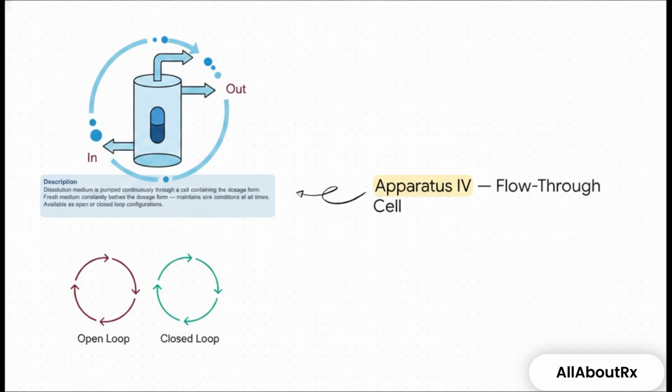What's super interesting about this mechanism is the total paradigm shift in fluid dynamics. Instead of just a set volume of liquid sitting in a vessel, fresh dissolution medium is pumped continuously through a cell containing the dosage form.